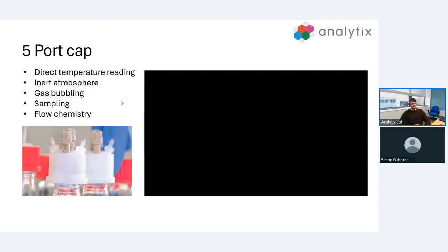This is our five port cap. The five port cap is an exceptional accessory for boosting flexibility of the system. This replaces the standard cap and essentially is just a cap with five modifiable inlets and outlets. This enables you to customize your setup for your specific application. For example, with a five port cap we could have direct temperature readings via our thermocouple in one inlet. We could be cycling in an inert atmosphere in series or just bubbling with inert gas.